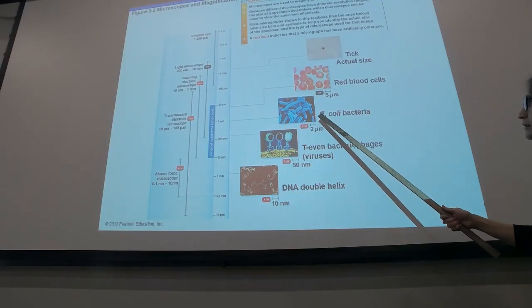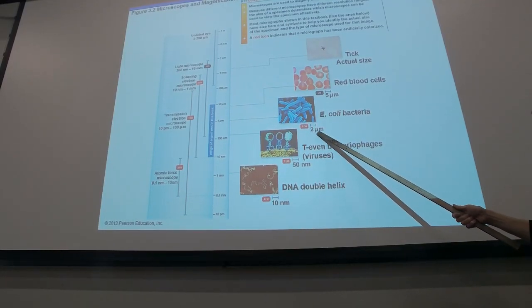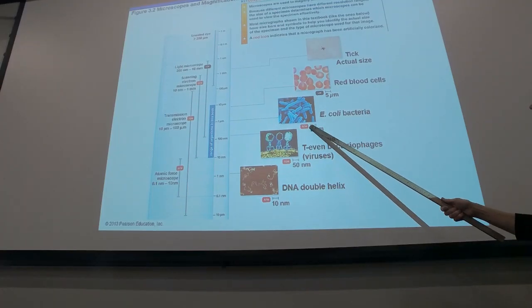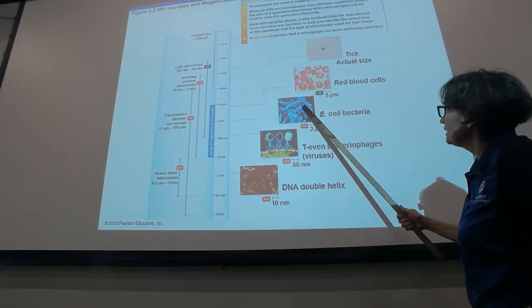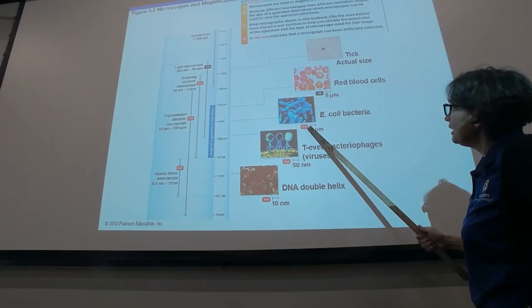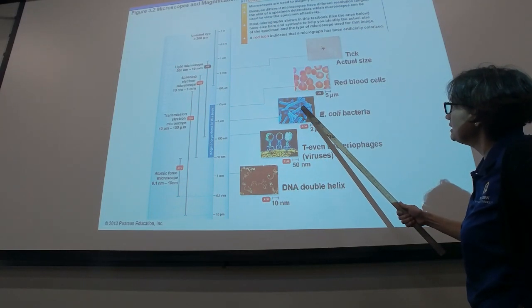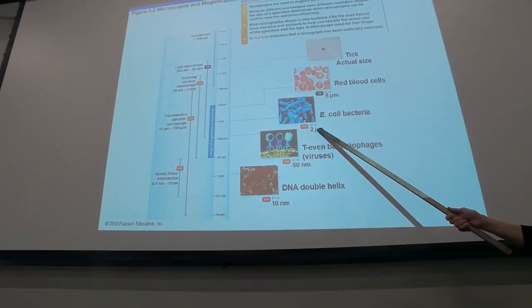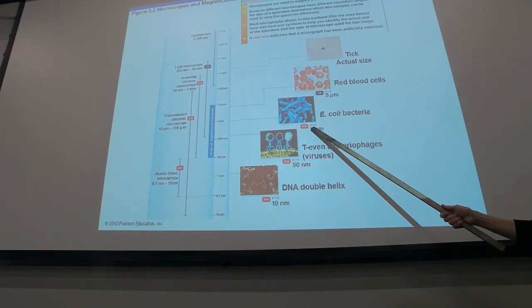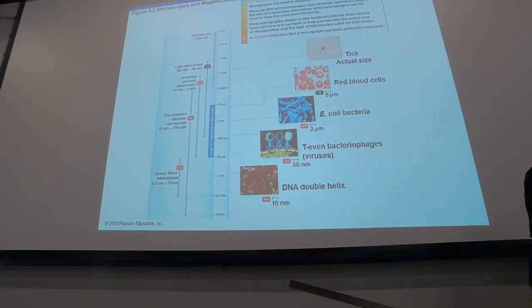Now, E. coli, with this bar scale, which is in this case micrometer still the unit, if you measure it in length, more or less, in this case, this tiny one, this one that is about to divide, is about 2 micrometers in length. And then in width, if you extrapolate, well, it can be like 1 micrometer.